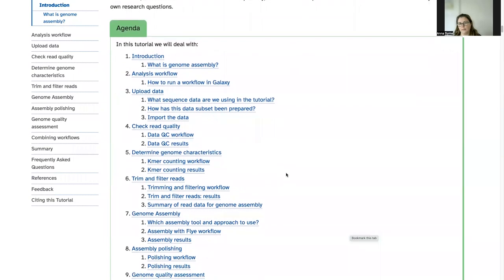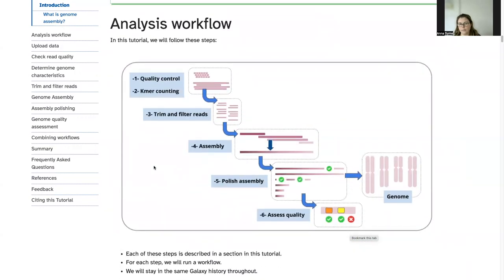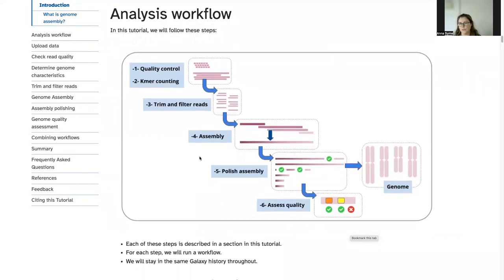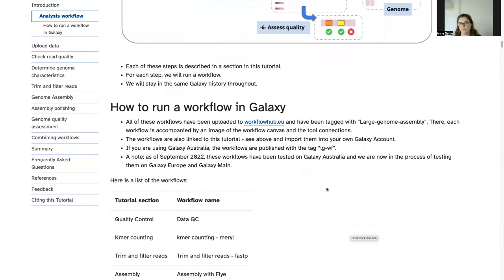So in this tutorial we're covering various steps. This is a picture of the analysis workflow that we'll be following. It involves quality control, counting the k-mers in the reads to get an idea about the genome characteristics, trimming and filtering reads, assembling and polishing the genome, and then trying to assess the quality of our genome assembly. We'll actually run these as separate workflows and we may change some of the parameters in each workflow as we run them. Rather than running all of the separate tools, we'll be running a set of workflows. The tutorial explains how you can run workflows in Galaxy and where you can import these workflows from.